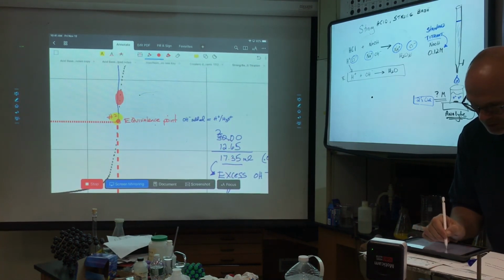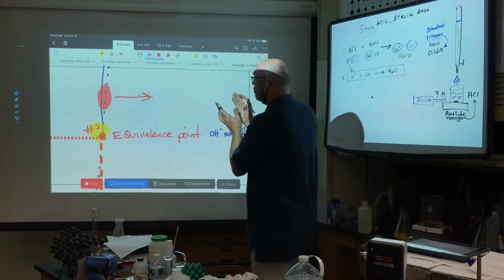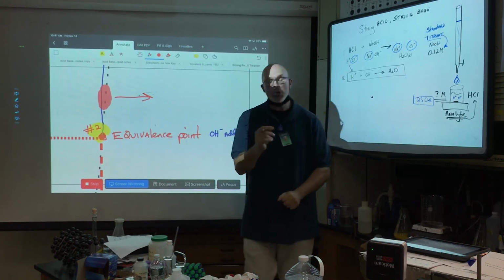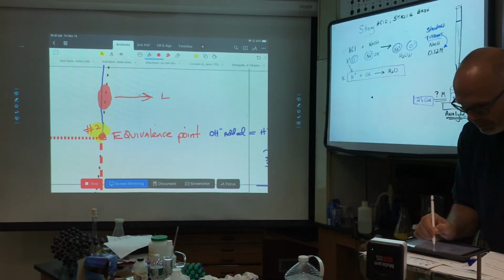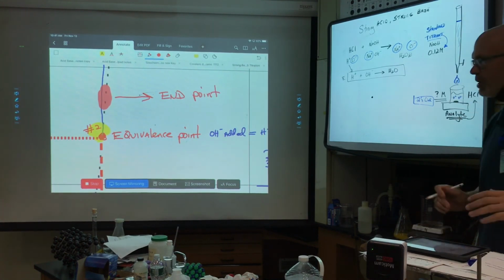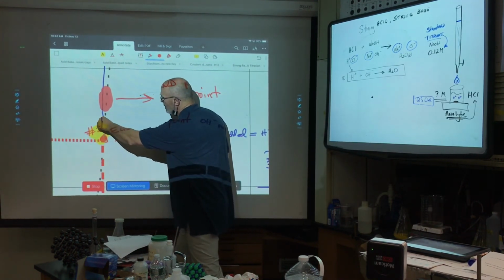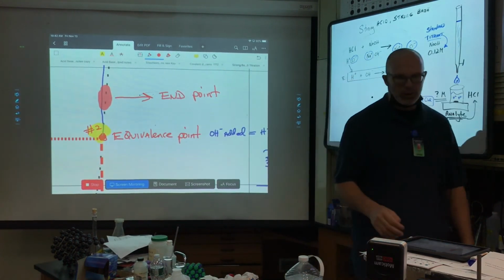So we call this the place where we stop the titration if we use an appropriate indicator, where its color change, or pKa, we'll learn about that, is closest to the equivalence point. We call this the end point. The end point of the titration is where we stop the titration if we're just using an indicator, and that would be a very close approximation. I mean, what is the difference between this line and this line? Very, very small when you look at the big picture.